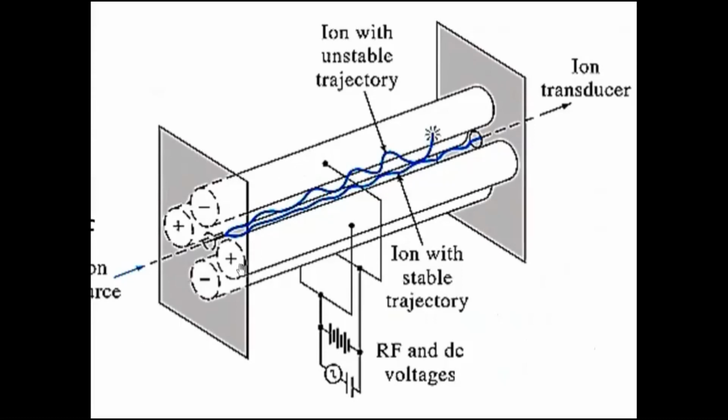I was telling that the frequency is low. Now imagine the ion which is positively charged and it is very lightweight. The moment it is near to a negative rod, if the ion is light, it will immediately hit it, because its weight is light, it can travel faster. But the ion which is comparatively heavy, when it travels near this negatively charged rod, the negative rod becomes positive.